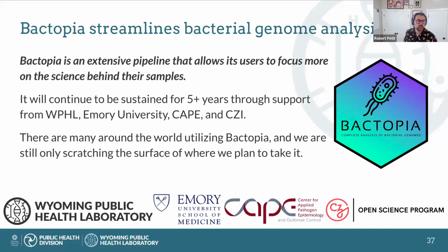But yeah, to sum it all up, Bactopia is an extensive pipeline that allows its users to focus more on the science behind their samples. Thankfully, it'll continue to be sustained for another 5+ years through support from Wyoming Public Health Laboratory, Emory, CAPE, the Center for Applied Pathogen Epidemiology, and CZI's Open Science program.